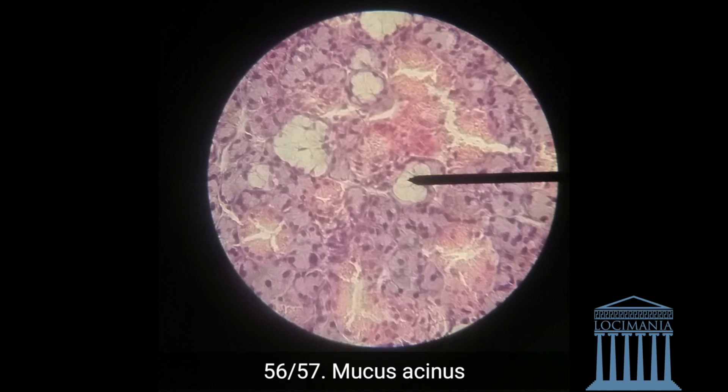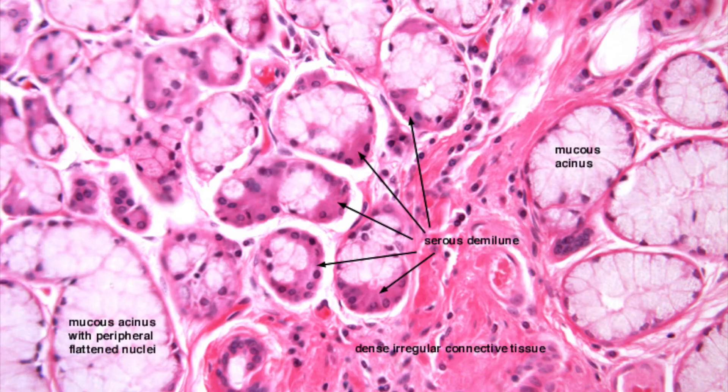The mucus acinus is hollow. Here is another picture where you can see it more clearly — the serous demilune on top of the mucus acinus, and the hollow part is the mucus acinus. And that was everything of slides 56 and 57. Thank you and please come again.